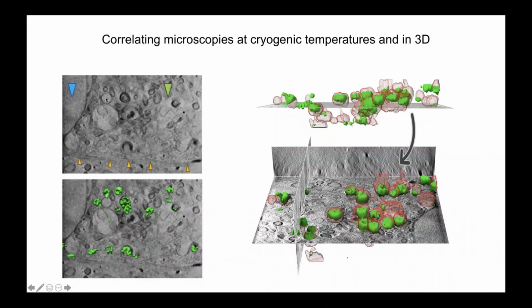If we have this extremely detailed 3-dimensional ultrastructural map, where we can see nucleus, bodies, endosomes, a lot of structures that we haven't seen before in these cells, and then once I put the fluorescence in, and I'm using only the green fluorescence, I can tell you immediately that this structure that I see here, quite heavy in carbon, remember the contrast we're looking at is carbon here, is all viral related. I can focus on only these vesicles. I don't need to look at the others that are not playing any role. And of course, this whole thing is 3-dimensional, as you see here.